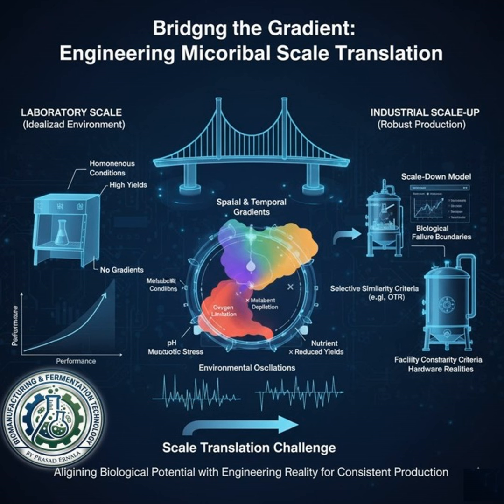Okay, so that leads us to the engineering solution. If we know we can't hold everything constant, how do we actually manage the scale change? We use tools like dimensionless numbers, but differently, with selective similarity. Selective similarity is all about making smart trade-offs. Dimensionless numbers are great tools, the Reynolds number for turbulence, PV, kLa, all of them. But just picking one and trying to hold it constant is, well, it's scientifically inadequate.